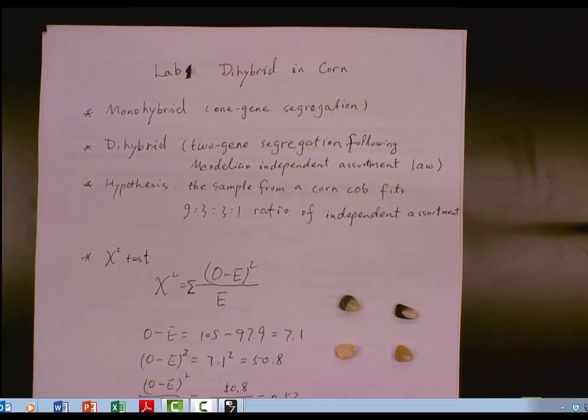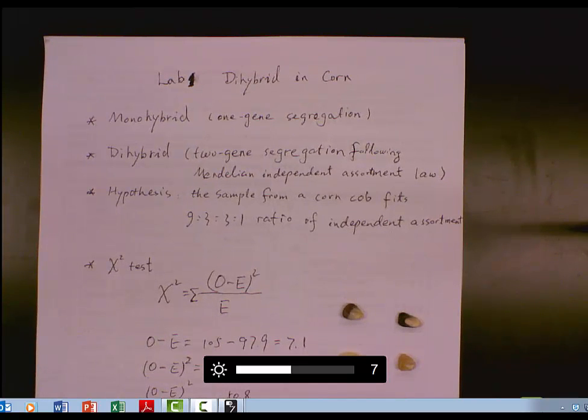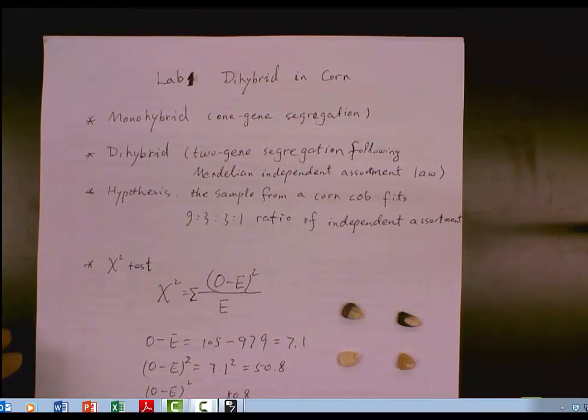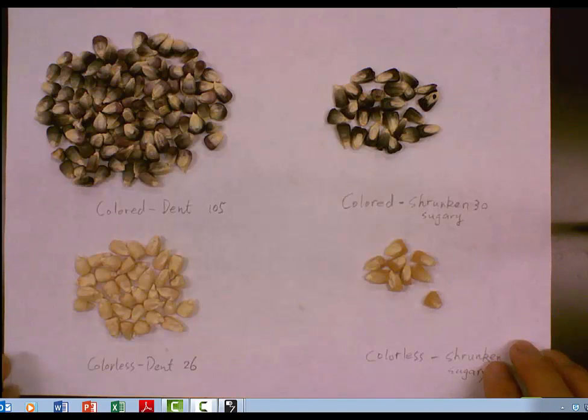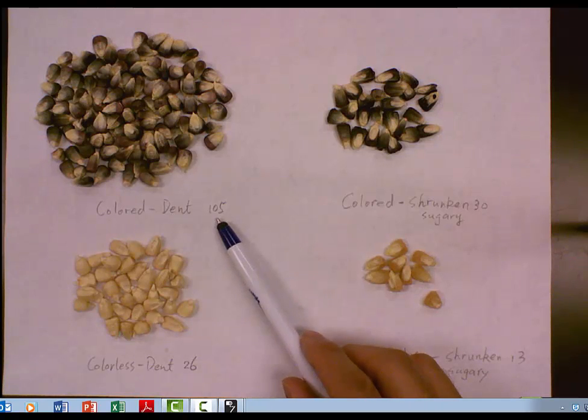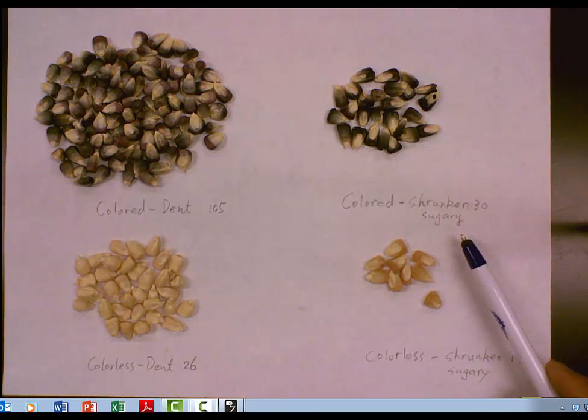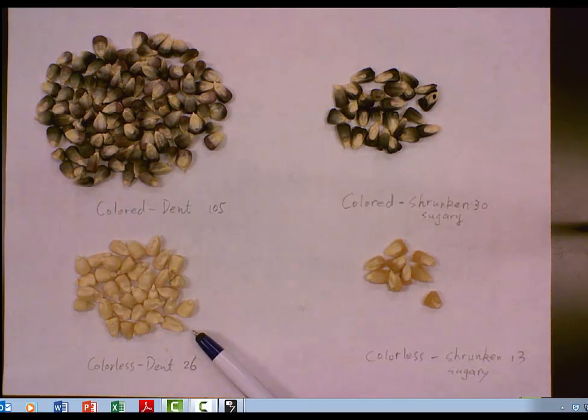A hypothesis is that the sample from the kernel cobs fits 9:3:3:1 ratio of independent assortment. The result I get is four groups. This is colored dent 105 kernels. And this is colored and shrinking 30 kernels. This is colorless dent 26 kernels. And this is colorless shrinking 13 kernels. Those are the observations of the sample from corn cob.